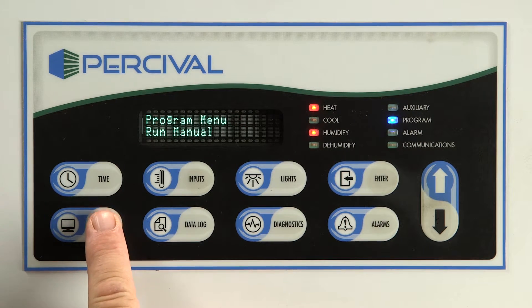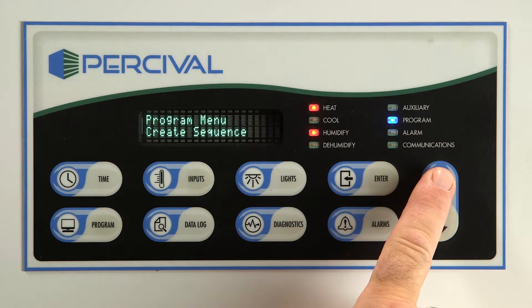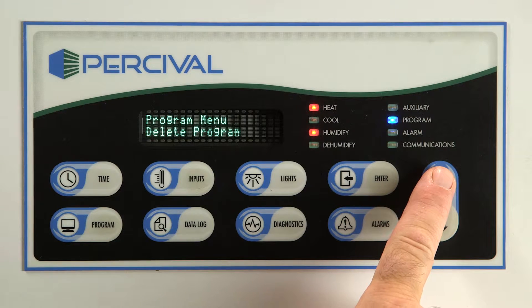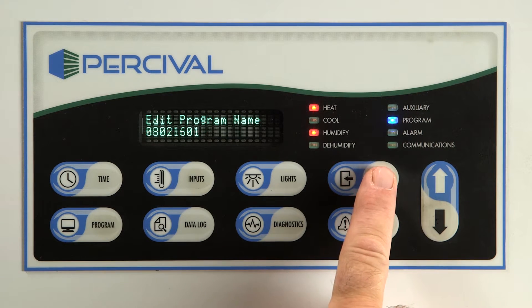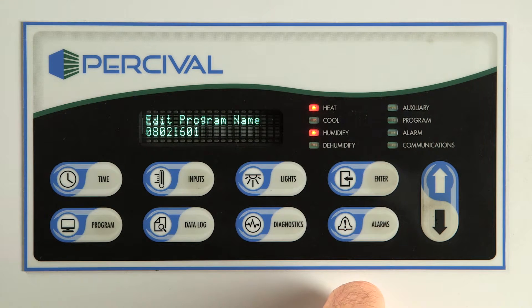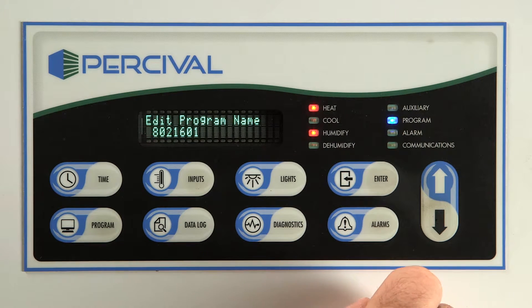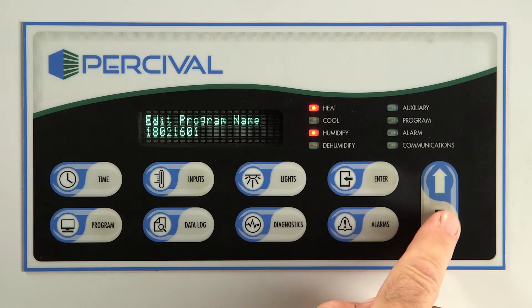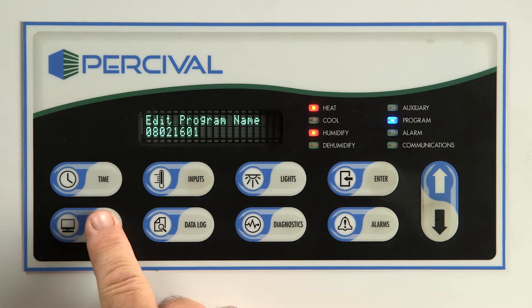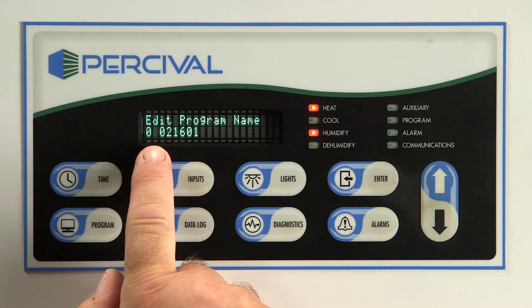Press the program key and arrow up or down to create program. Press enter. The program name will default to the date and the first program for that day. For example, 08021601 for the first program on August 2, 2016. The program name can be changed using the arrow keys. Remember, after you change the first character, press program key to advance to the next. Once the name has been keyed in, press enter.